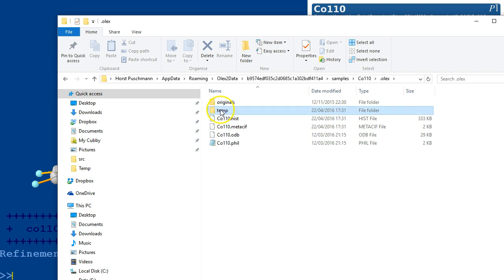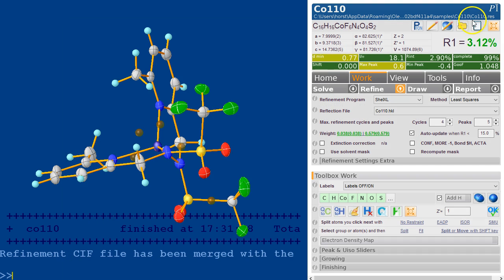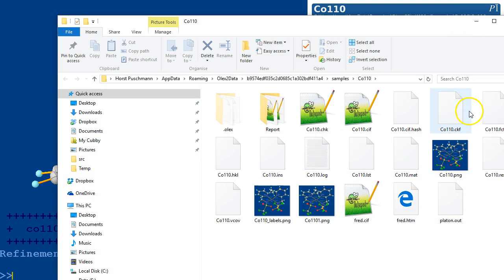In here is a temp folder. We copy the INS file and the hkl file and then we start the refinement using ShellX in this folder. Once ShellXL is finished, we copy the relevant files out of this folder back into the top level of this directory.